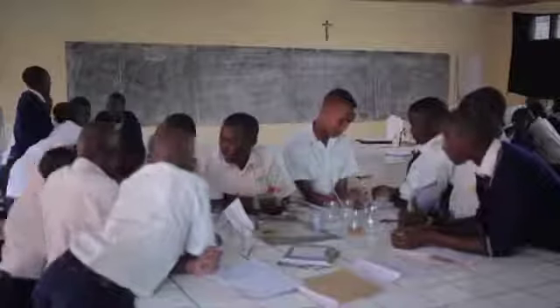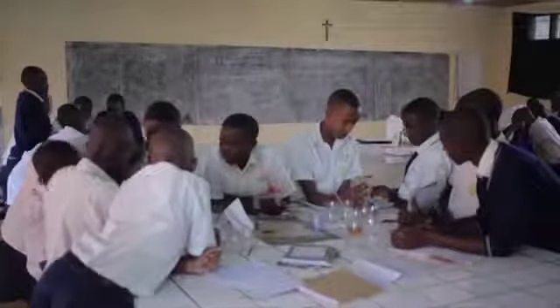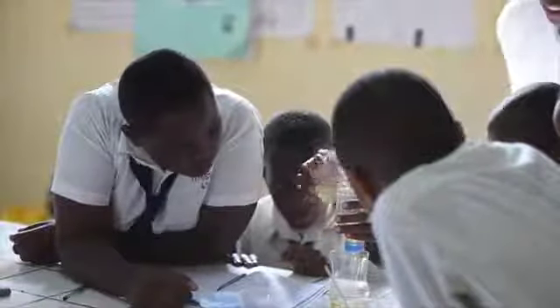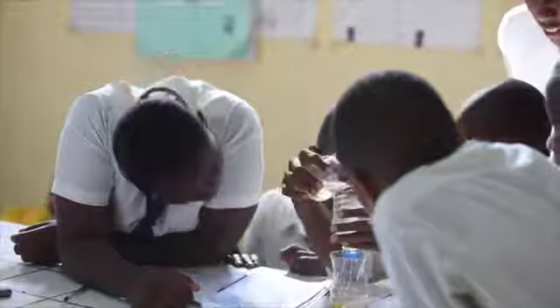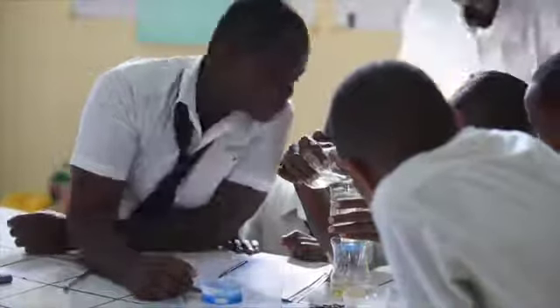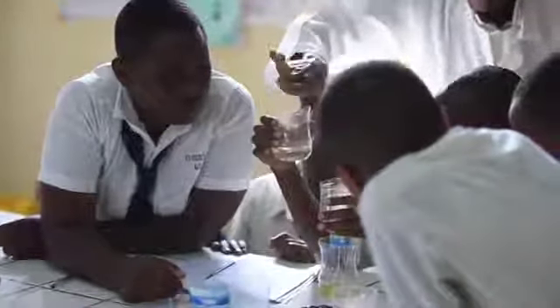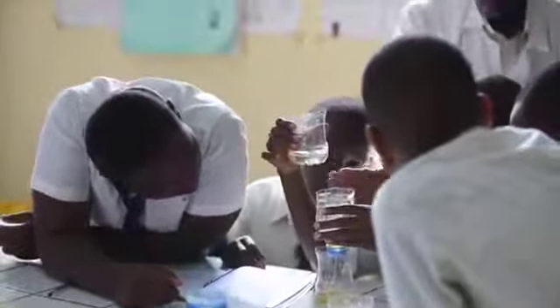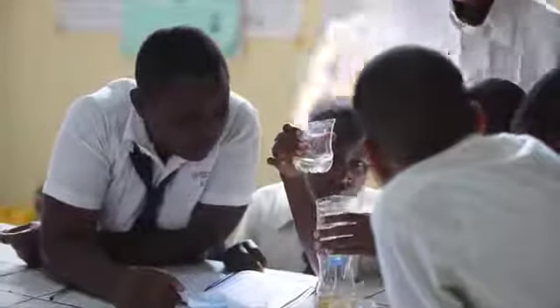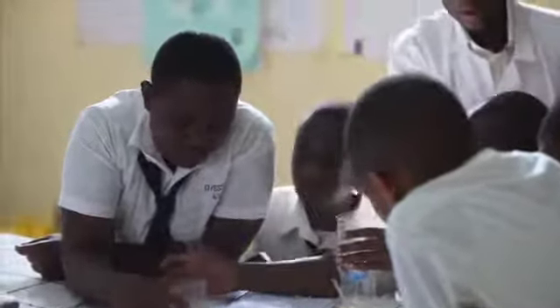Wow, very good. And there we are going to remain with the water. And now we have a small amount of oil remaining, but what we have there is enough. Now there's no problem. We can miss that one, but we have to keep our oil.